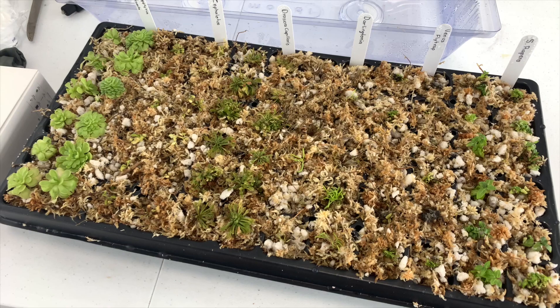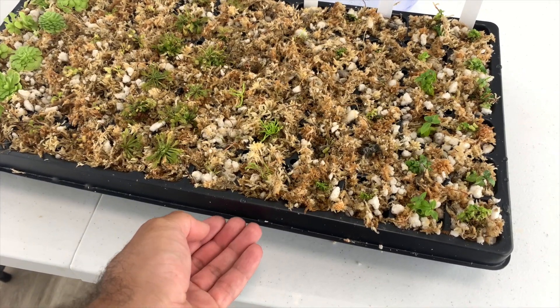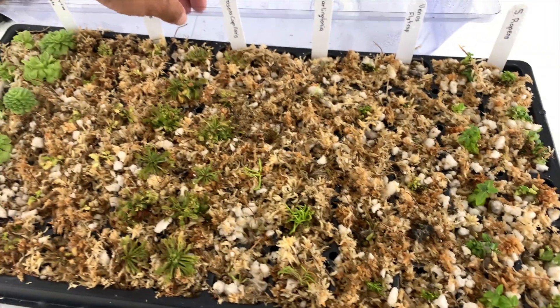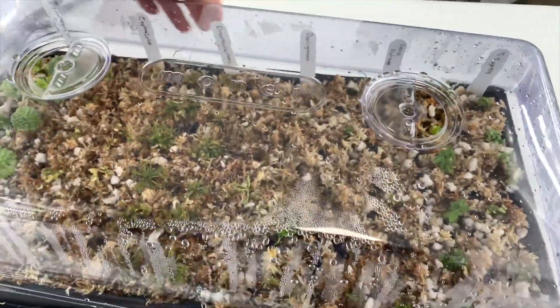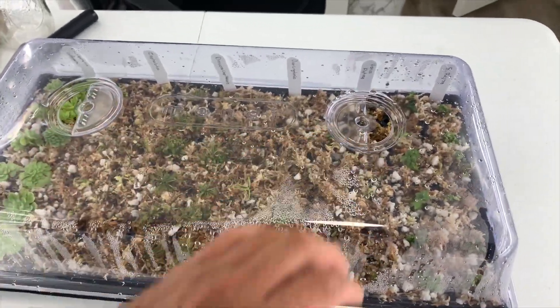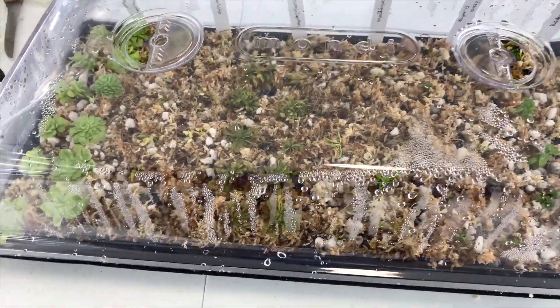They are on this flat. I think I need to add more water — it doesn't have any on the bottom, so it's time to add more. The humidity dome is still on, but now it's fully open and the vents are fully open all the time.